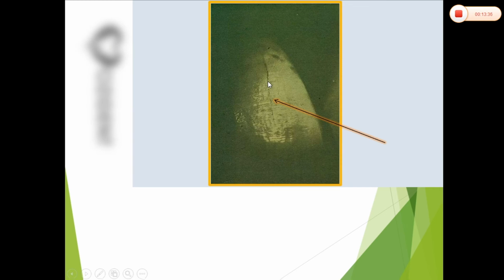This is the rod ends. Rod ends appear as concave areas on the enamel surface. The rod end shows as a concave area at the enamel surface, all of this. This is the crack area on the enamel surface.